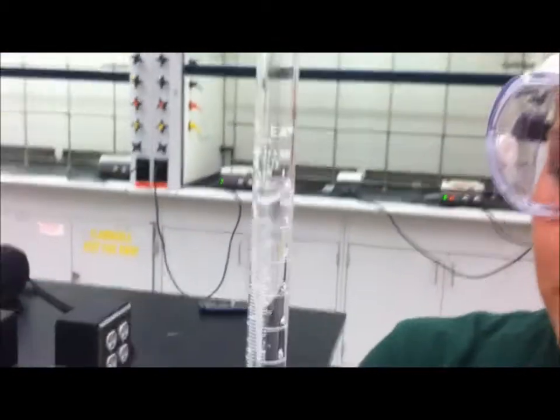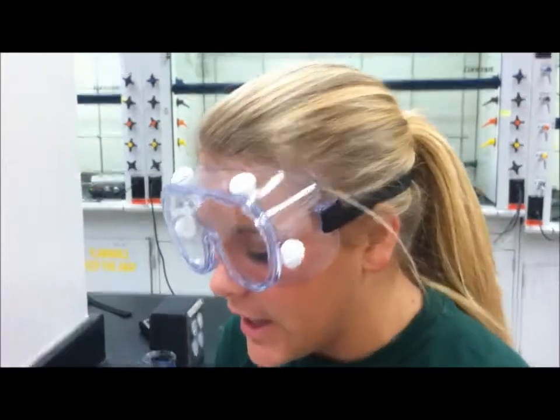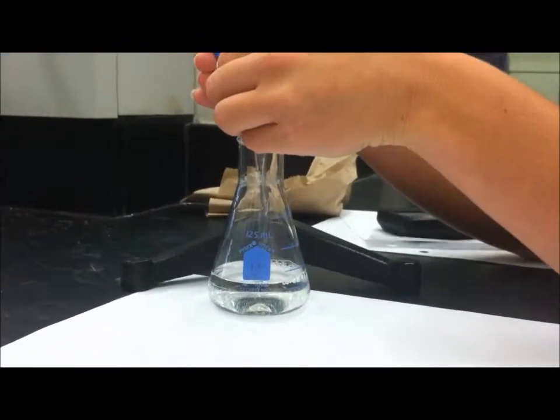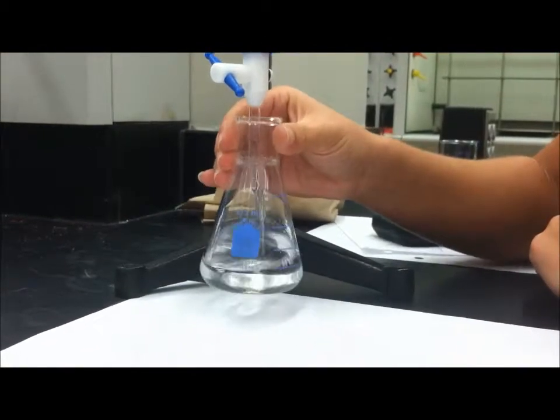The first thing we need to do is calculate the initial volume in our burette, and in our case, it's 0 milliliters. To perform that titration, you must release a little bit of the solution from the burette into the flask, a little at a time, and swirl it around in the solution so it gets mixed up.